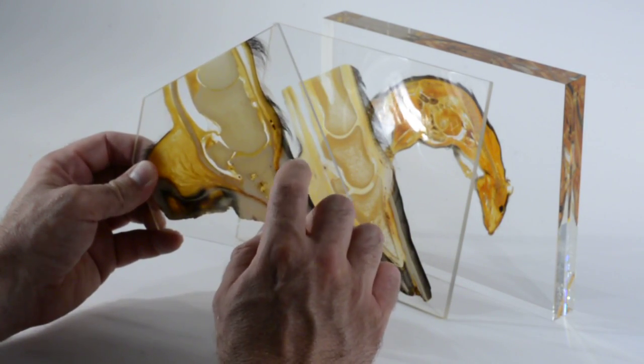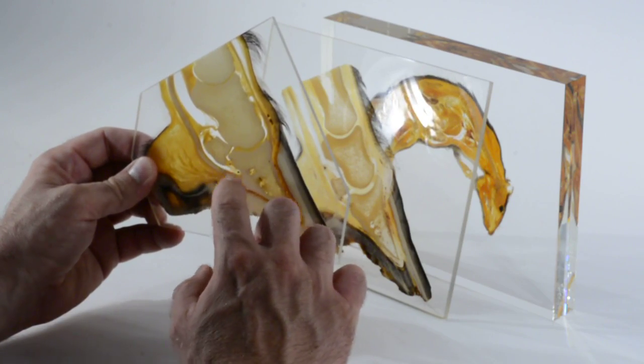less detail about blood vessels, fine nerves, and finest structures.